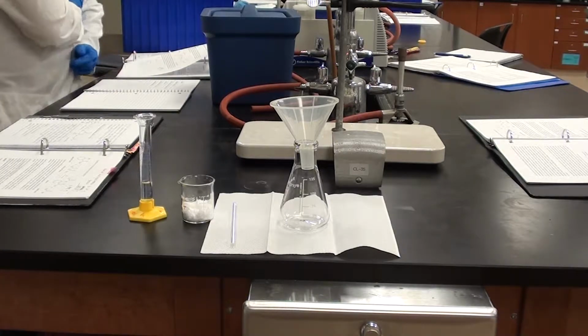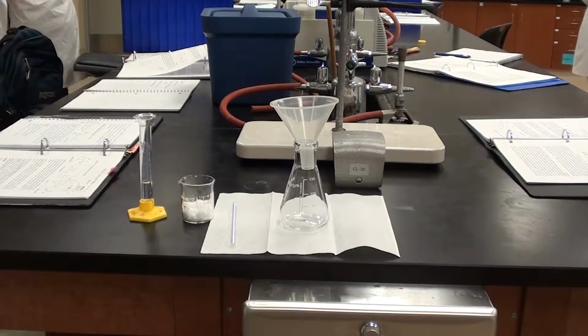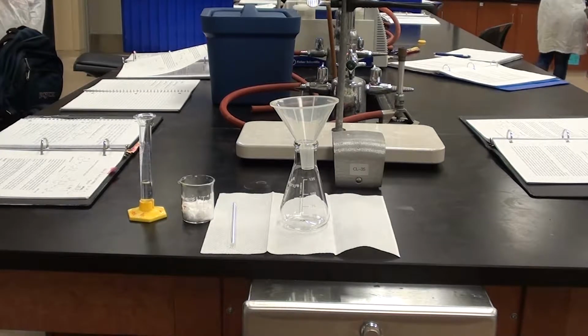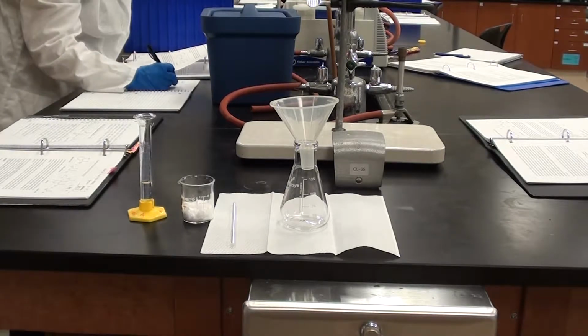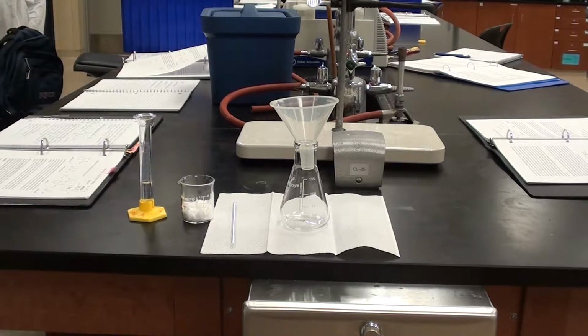So what we're going to do is we've got 1.99 grams of salicylic acid, and it said in the lab manual though that you needed 5 grams, and I don't think anybody's going to have 5 grams, so we're going to have to proportion out the acetic anhydride accordingly. Now, according to the lab, we needed 10 mils of acetic anhydride for 5 grams of salicylic acid. So if we've got 2 grams, then around about 4.0 mils is what we would need for the acetic anhydride.